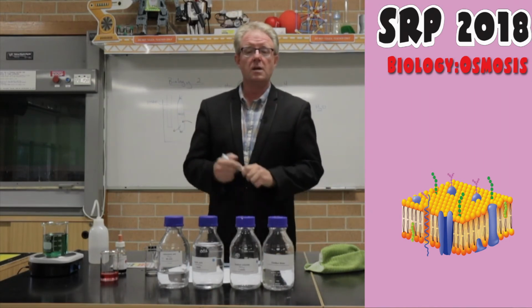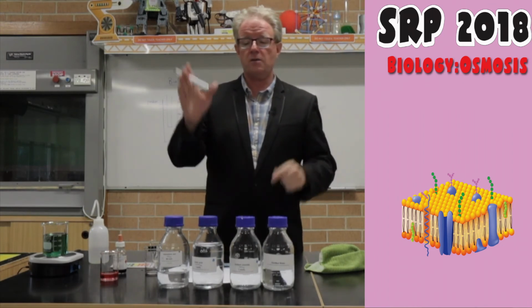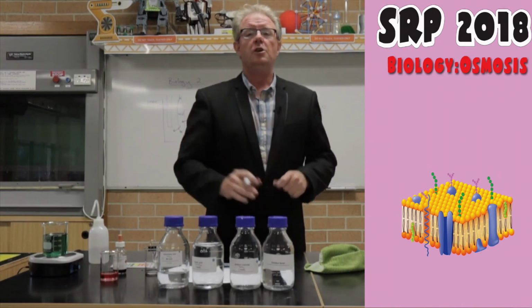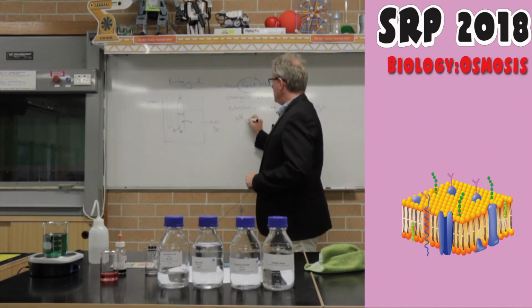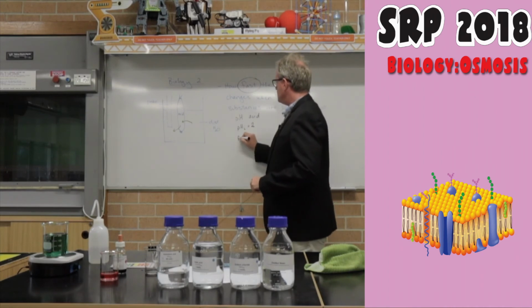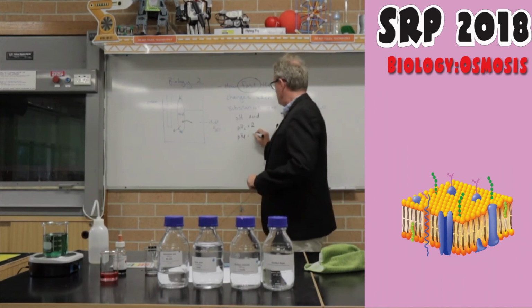So remember here, we're talking about the change in pH values. And so what you should have after collecting all your data is a table that will have the initial pH of all of these solutions. You'll then have the final pH. So let's just show you roughly what you're going to be doing. If you have the pH of the acid, so we have the initial pH, so let me just write it like that, little i means initial, and I might find that the pH of the acid started off with, let's say, 2. And then after 2 minutes, the final pH, right, subscript f, is 4, let's say.